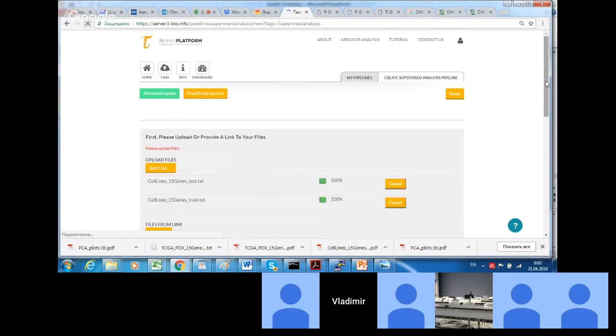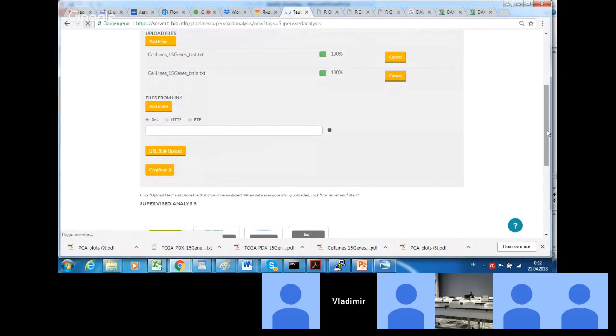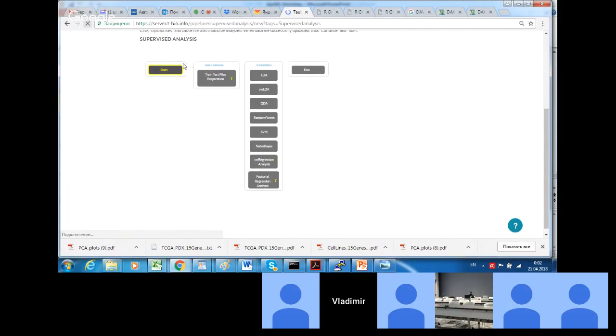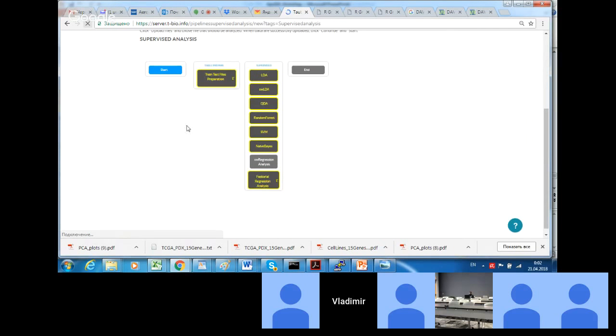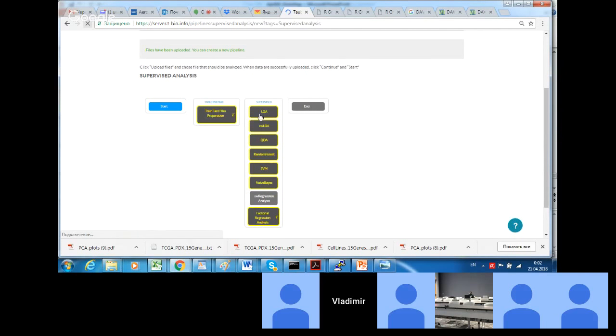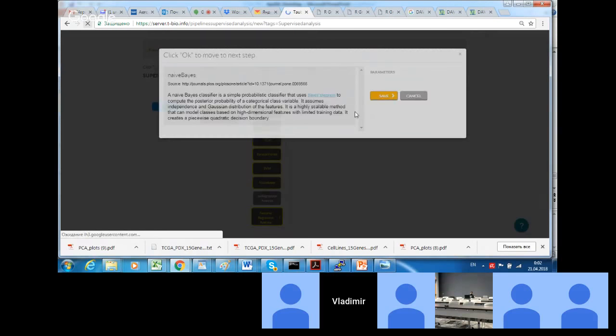So we upload two files. We need just 2 more minutes and we'll see the results. And we select one of the machine learning methods. As we discussed, there is linear discriminant analysis, for example, random forest, support vector machine, naive Bayes. Let it be naive Bayes.